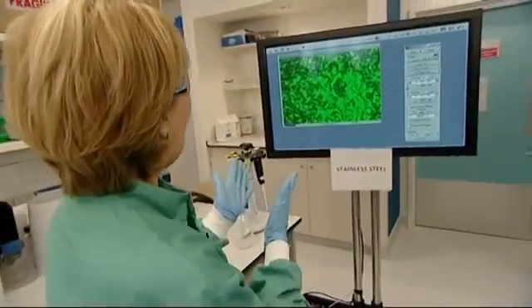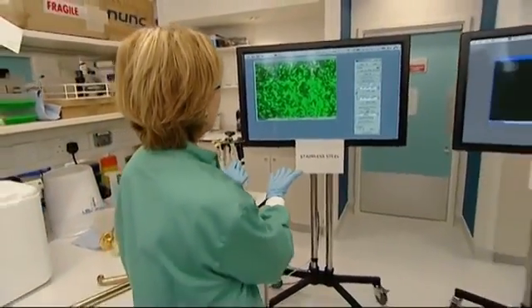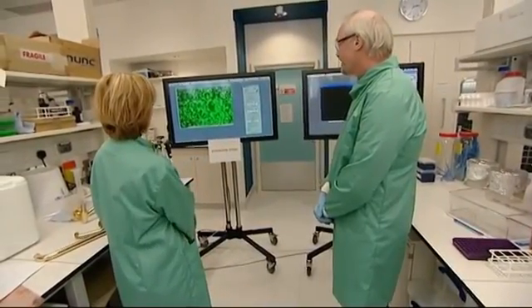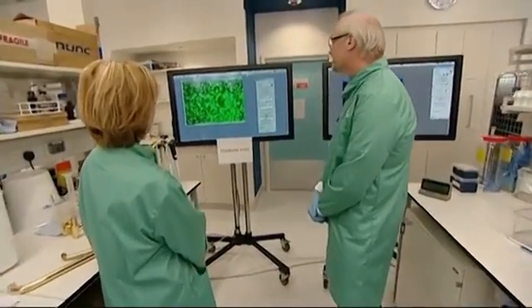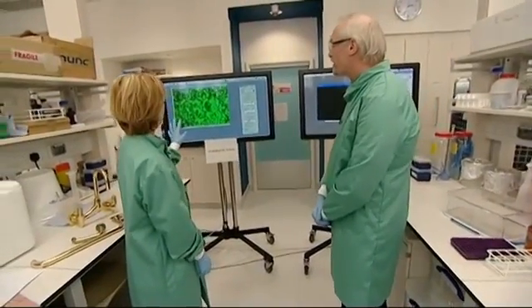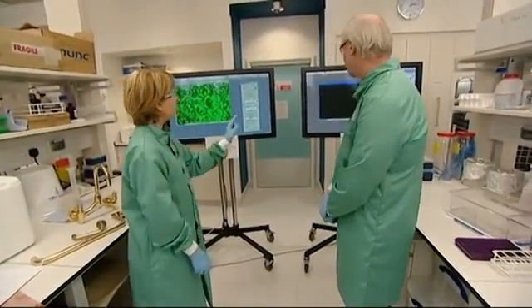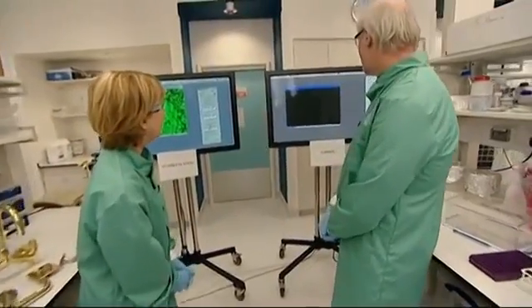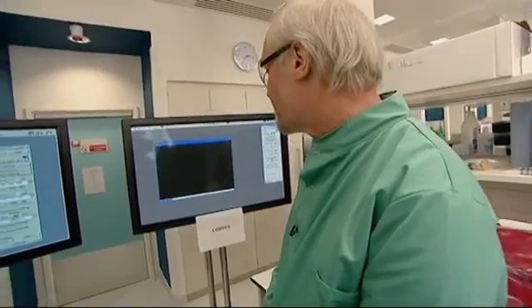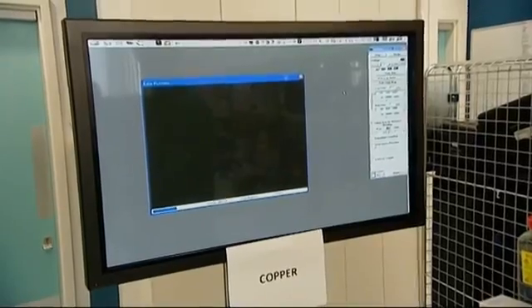We'll be coming up to 9 minutes now. Let's look at the screens linked to those microscopes. And this is stainless steel, and Professor Keevil still looking full of MRSA microbes. Yes, they're still surviving very nicely on the stainless steel. When you say very nicely, how long will they stay there for now? Oh, they could be there for days or weeks. Days or weeks. Let's look at copper. Well, I think now we're struggling to see anything on this image, showing that the bacteria have all died off on the copper surface.